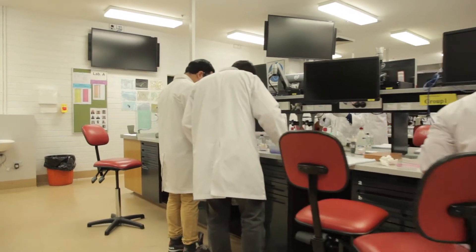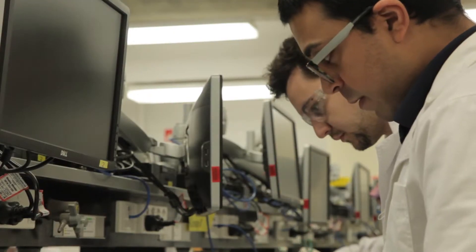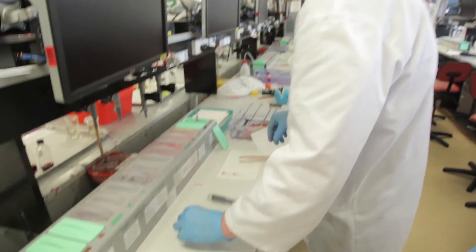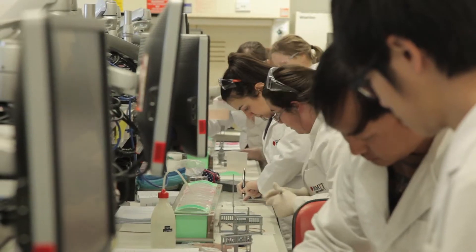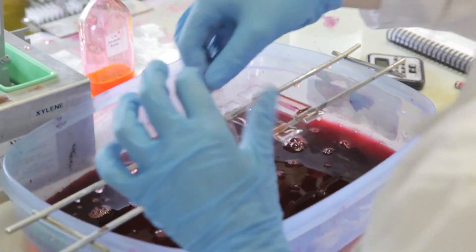So during the class, they take notes of the results of their experiments and then they submit an online pro forma, which they have a week to do after the class is finished. We used to force them to do that during the practical class and they got really stressed under the time pressure of having to write all of their results in the two hour timeframe, plus do the experiment. Because like today, we had a very long lab — just ran on time — but people are still in there now, run over time and then they're in their lunch break working because they didn't go through the study materials beforehand.